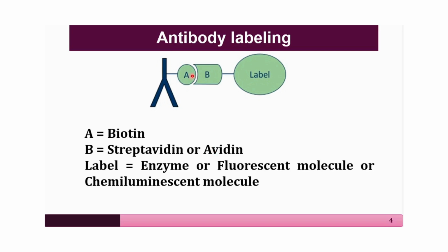Now, before binding the streptavidin or avidin to biotin, these two molecules can be independently made to react with the label. Here, label stands for either an enzyme or a fluorescent molecule or a chemiluminescent molecule.